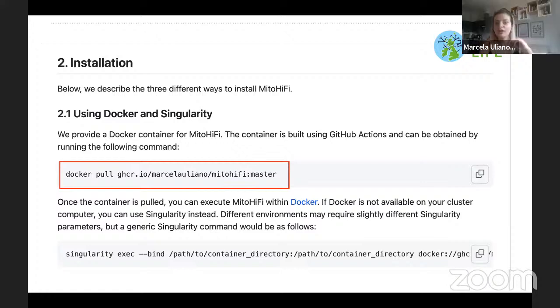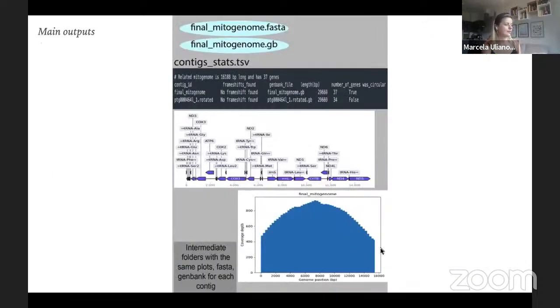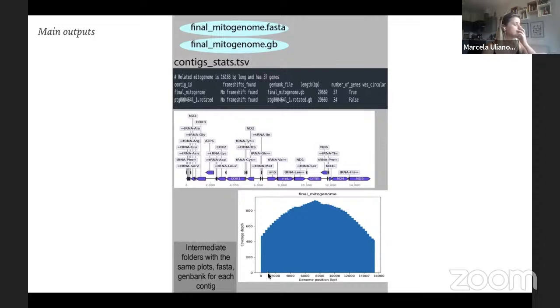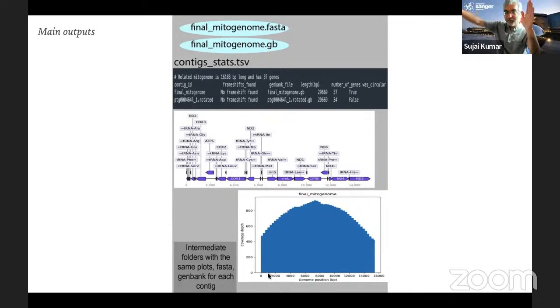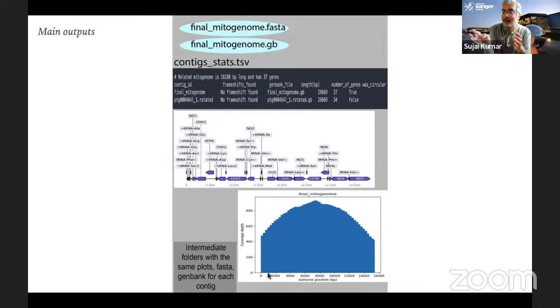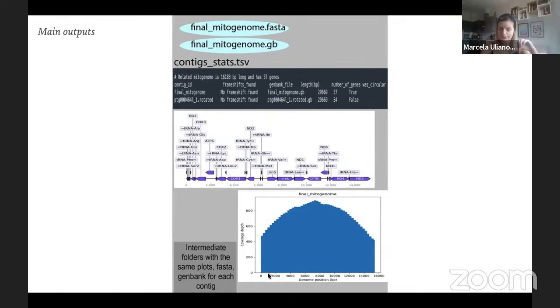Question: if the mitochondria is circular, why does the coverage fall at the start and end of the coverage plot? Basically it's an artifact of mapping to a linear contig. Reads that map at the end also map at the beginning — but because it's shown as a linear contig, half of the read isn't mapping at the boundary. If you had two copies placed next to each other, coverage would be uniform throughout.